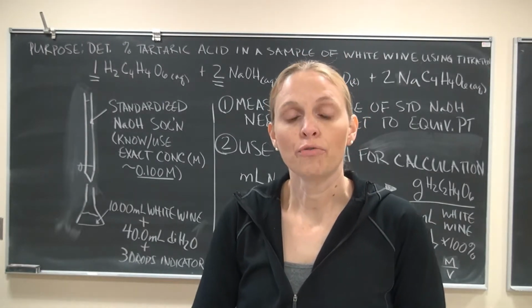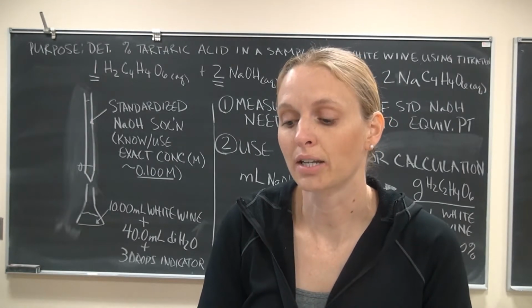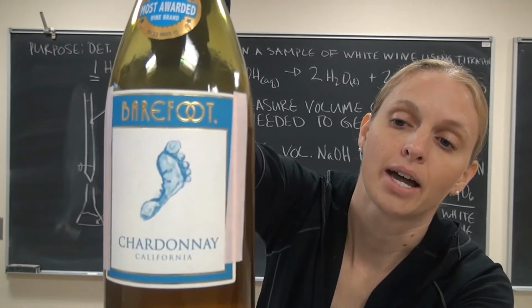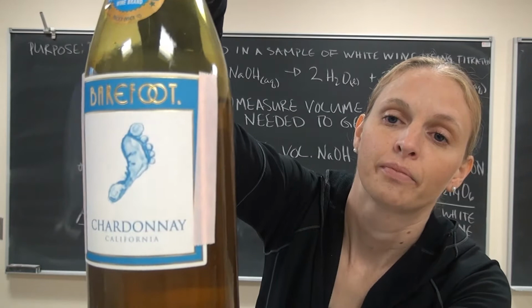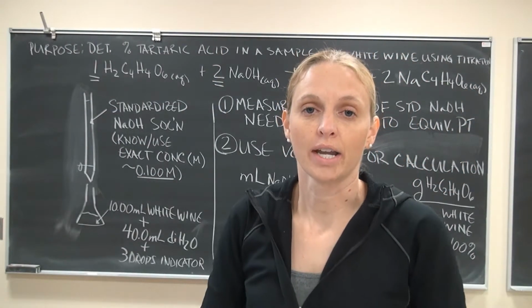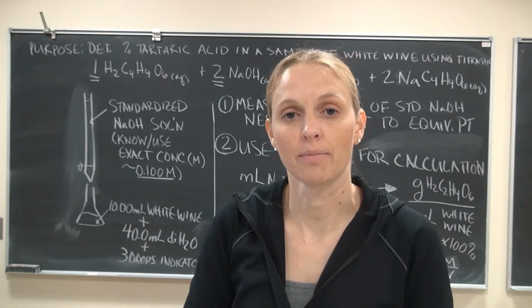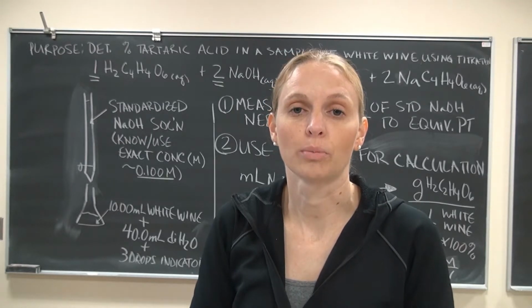All right, so for today, you're going to determine the percent of tartaric acid in white wine. This is the sample of white wine that I have taken all the samples from to measure. White wine, all different types of wine, have a variety of different chemical components in them to give them their flavor and taste. Particularly the acidity component is extremely important.